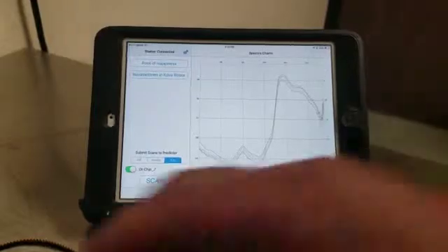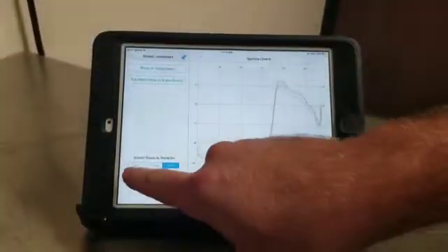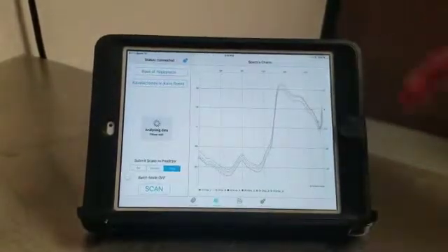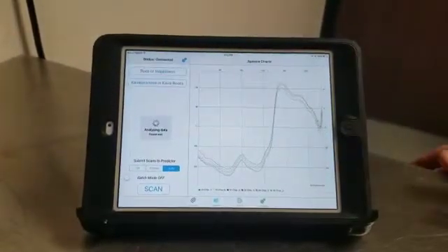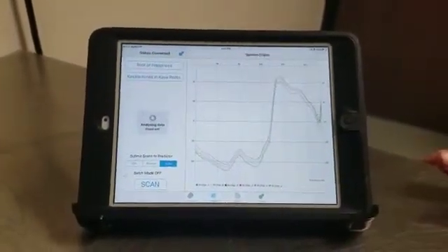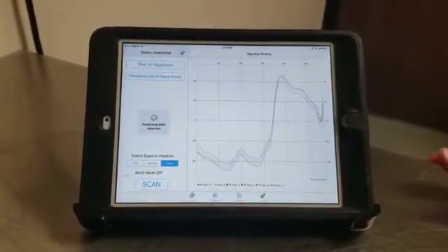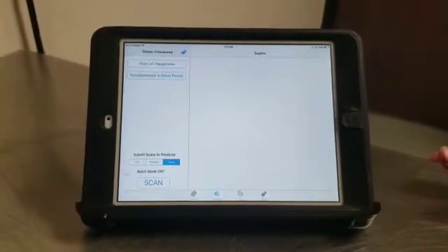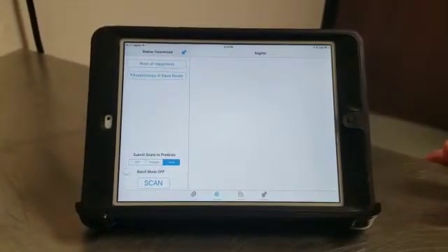And our internet is slow today, so it's going a little slower than we want it to. When we're done with this, we undo the batch mode. This automatically sends the data into the cloud, puts it through our self-learning algorithm, and spits back a result.